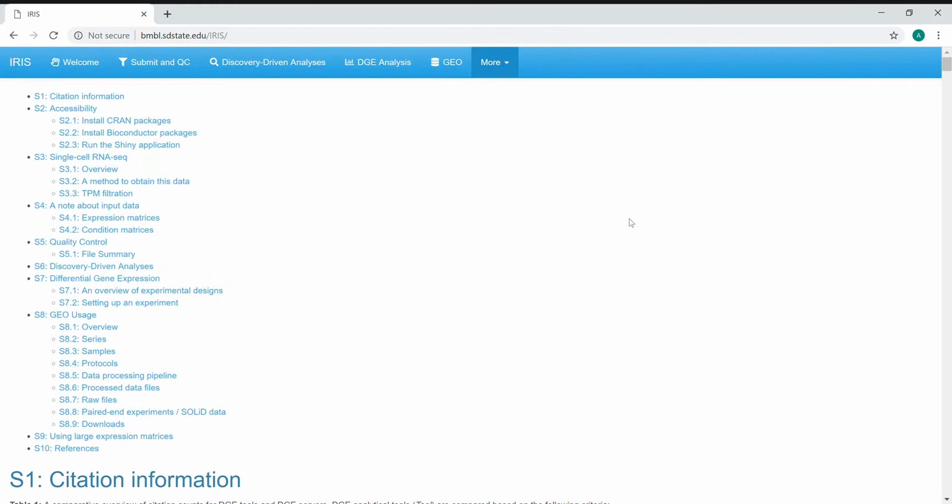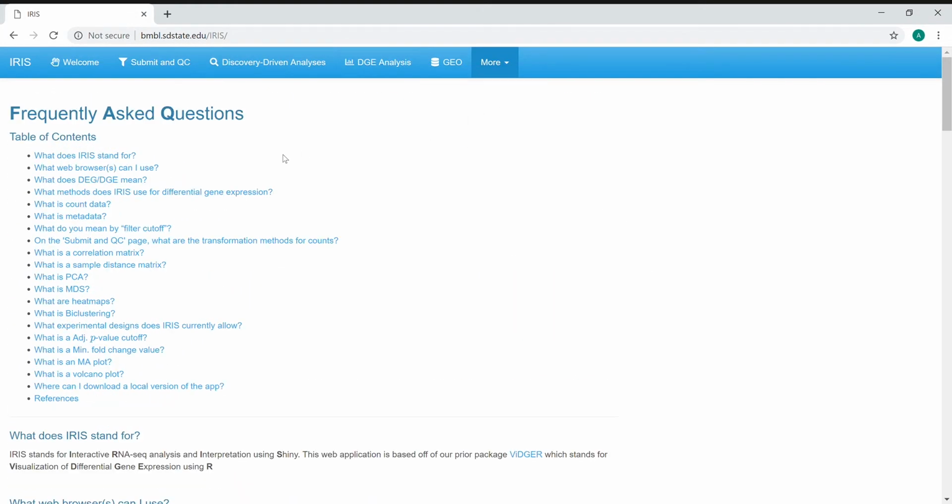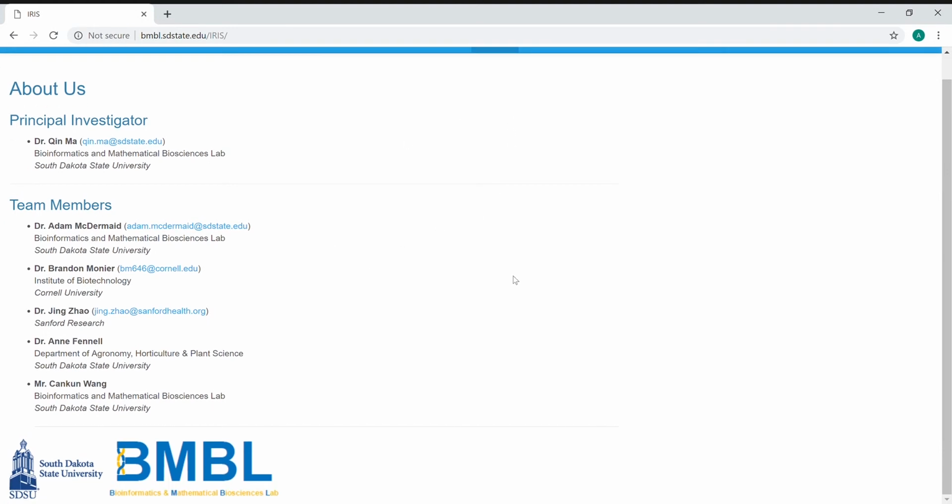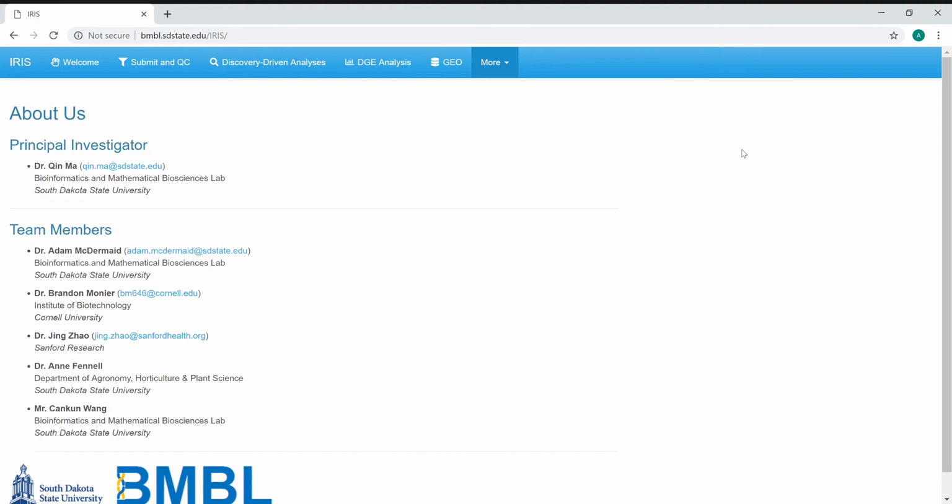just in an R session. We also have a series of frequently asked questions, ranging from something as simple as what does IRIS stand for, to a lot more complex things like what is PCA and MDS. The About Us section has information related to the people who are involved in this project, so feel free to reach out and contact us if you have any questions. Thanks.